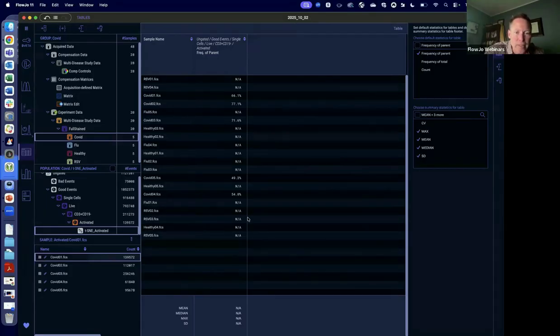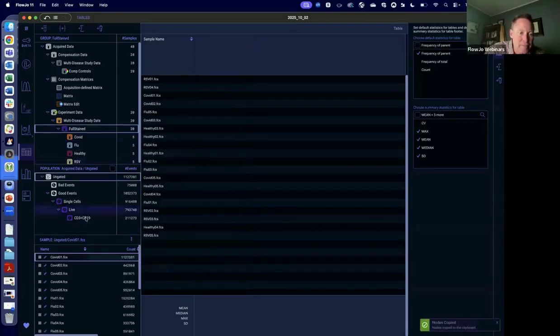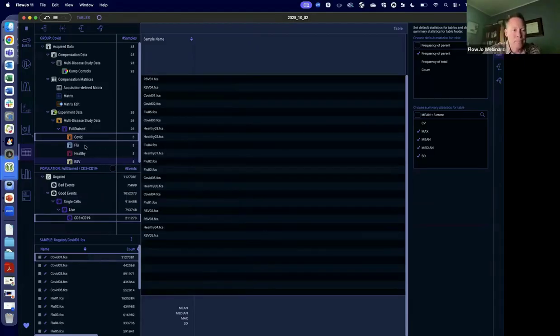Oh, I only did those on COVID. So let us drag in, let us take that one out. Actually, I could just copy that. Copy, activate it, and paste here. I must have dropped it. Or it's thinking. Yep, I've set it thinking.